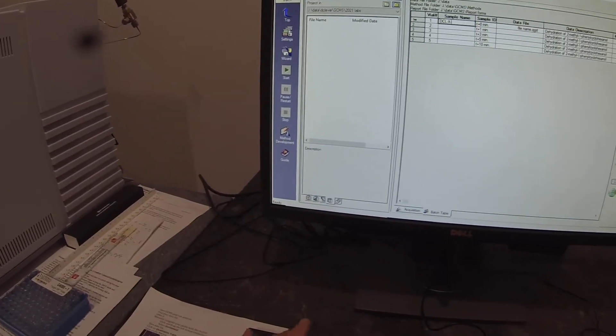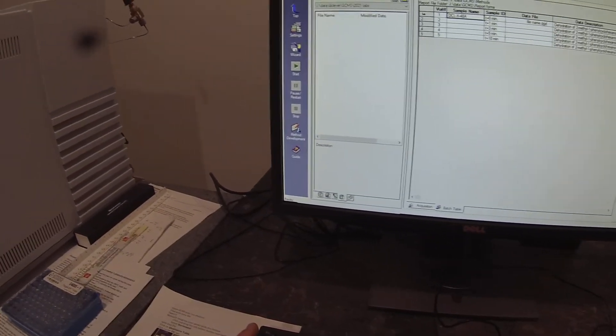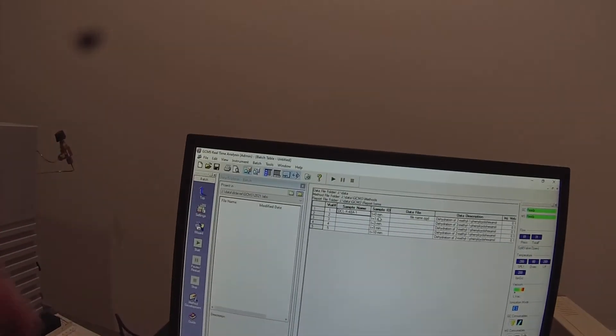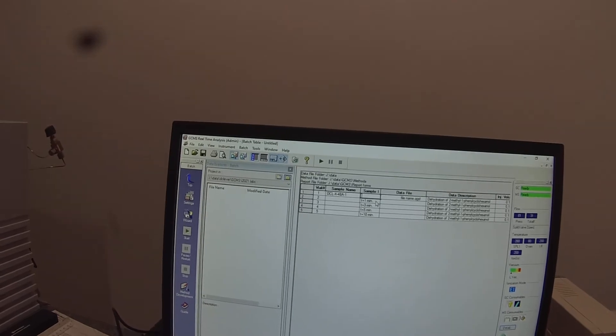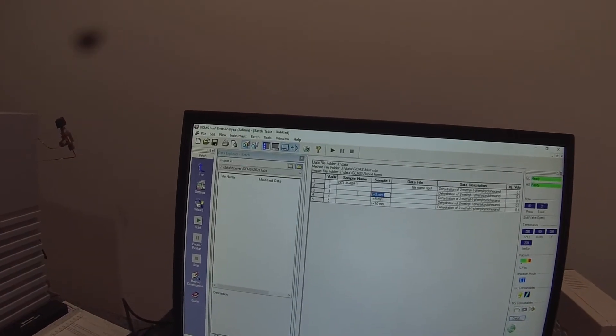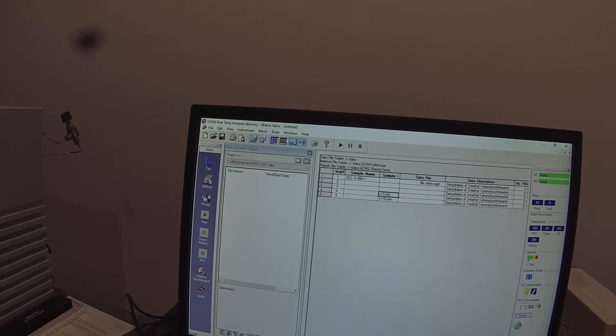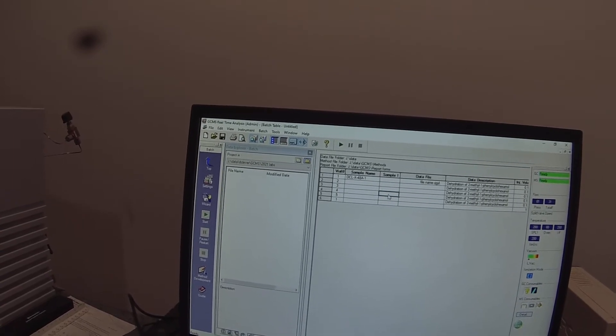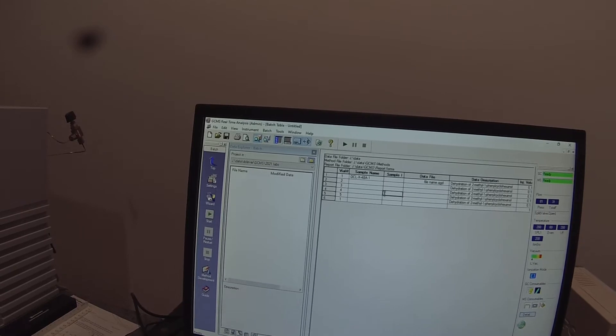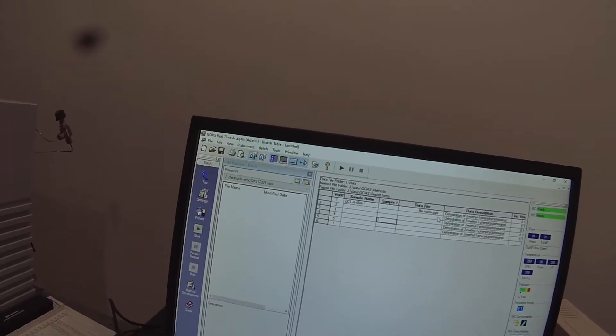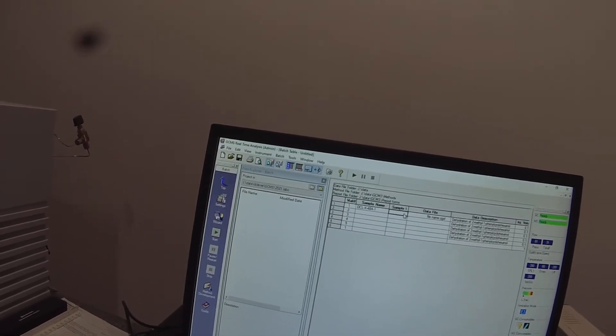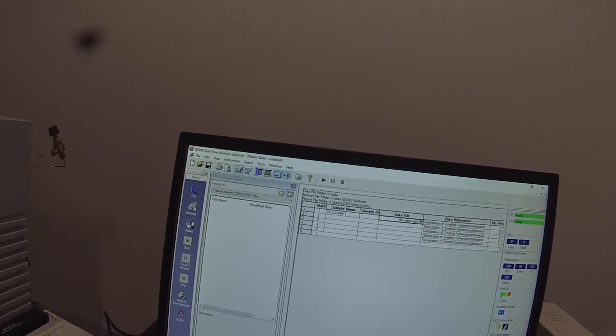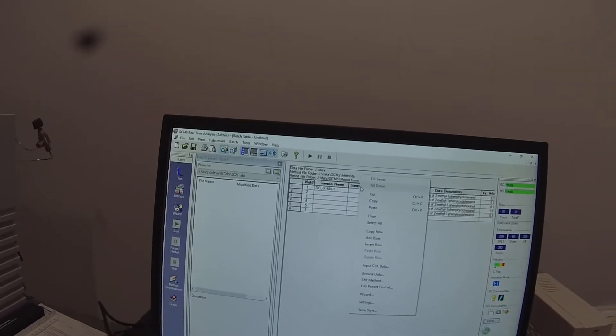So we have 48A. First piece of data on that, dash one. I'm going to delete these sample IDs. We don't really need a sample ID since we're not running a time point. So I don't even need that column.